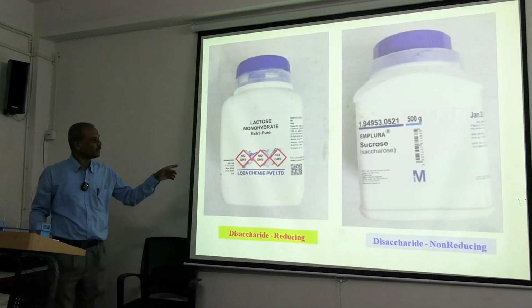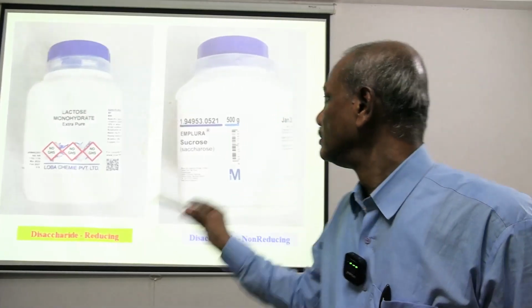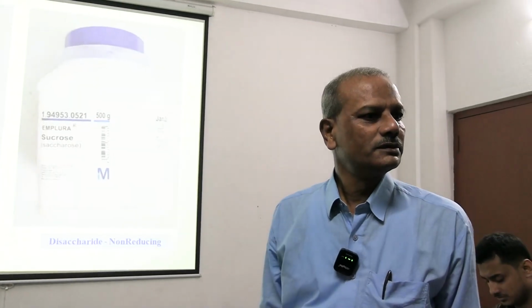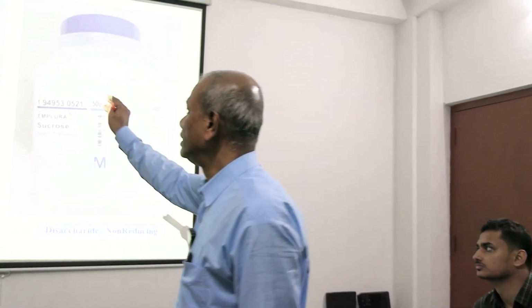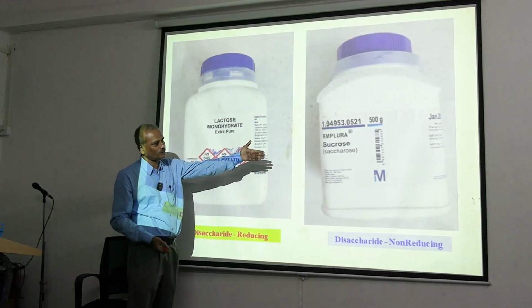Will lactose give a positive test or a negative test? Sure. Sucrose? Negative. You see, the packet is sealed; I will take a small amount of lactose and sucrose for that.